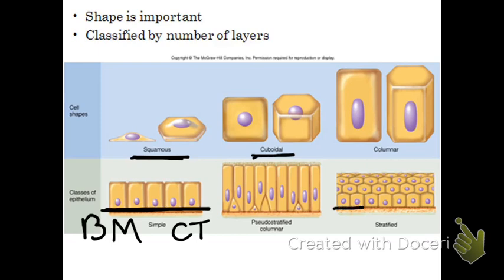Okay, so here we see on the stratified tissue, there is the basement membrane. Here are many cells that make up the epithelial layer. Because there's multiple layers, we're going to call that stratified. And below that basement membrane, deep to that basement membrane, one will find connective tissue.